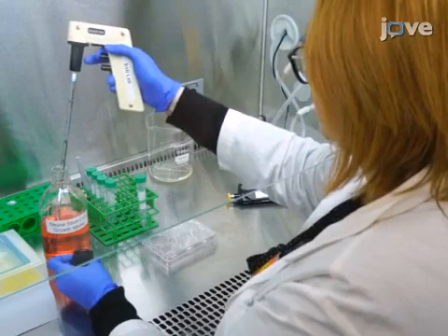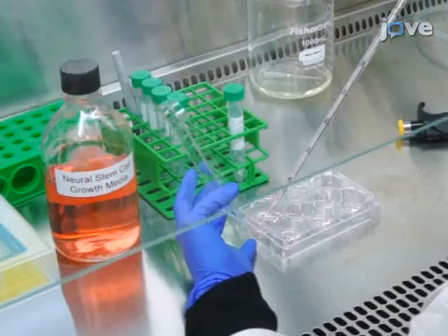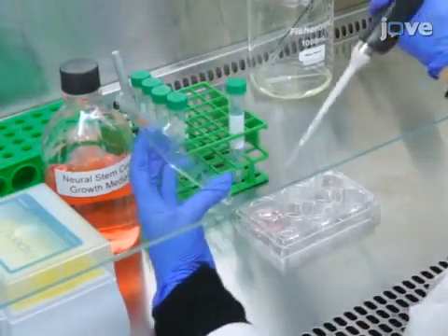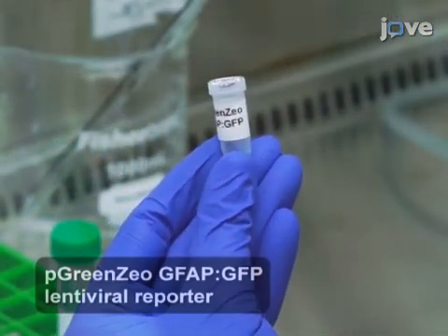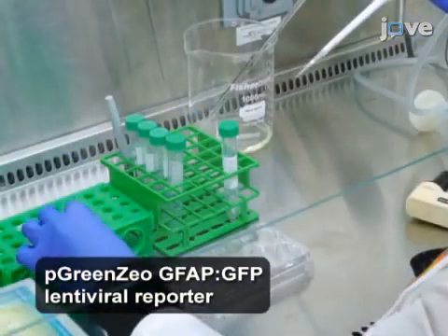To begin, seed 1 million glioblastoma stem cells, or GSCs, in 2 milliliters of complete neural stem cell growth medium in a 6-well plate. Next, transduce the cells with the lentivirus reporter at a multiplicity of infection equal to 5.